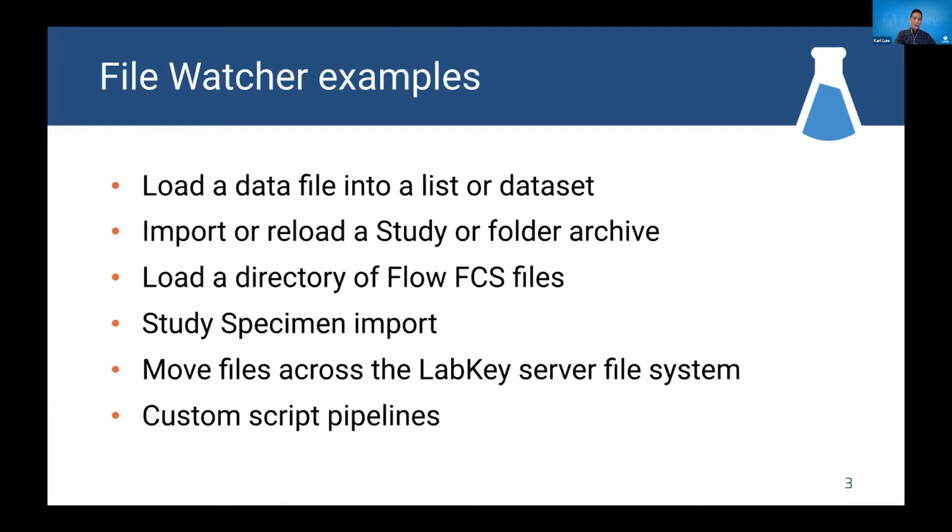You can also move files across the LabKey server file system. And this is pretty exciting. This is a recent feature addition: we now allow you to expose custom script pipelines. And I'll talk more about this later in this talk.